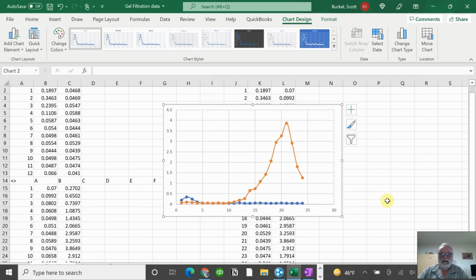So here we have the basic graph. If you remember, the ferrocyanide, the yellow colored one eluted from the column, was much, much brighter colored, and a lot of people noticed it kind of looked like Mountain Dew coming off of the column. And here we have the blue dextran, which was pretty low concentration, so the absorbance was not particularly high. But we'll go ahead and finish this graph, and I will show you the minimum of what I want to see in your results section that you turn in to me.